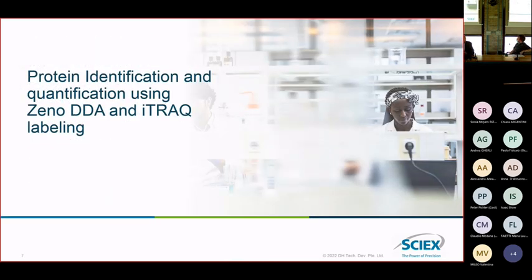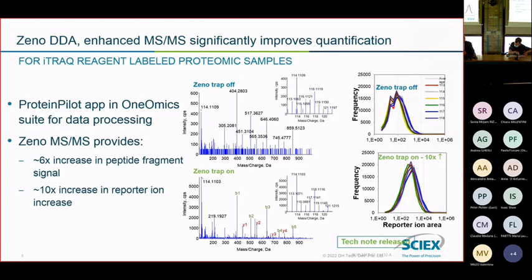So the first stop is, of course, the first strategy, which would be a label-based strategy. And the labeling-based strategy, I think, was mostly highlighted today, probably not enough on the carrier channel and the impacts of that, but I would recommend that you either read the papers or watch the presentation of the next speaker, which will cover those limitations. So the reason why some customers immediately approach SCIEX for this application had to do with two factors.